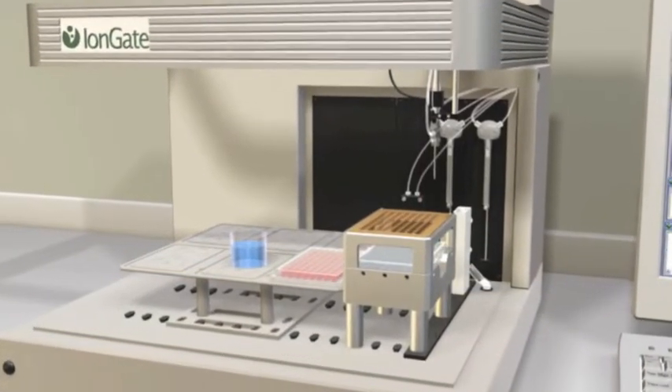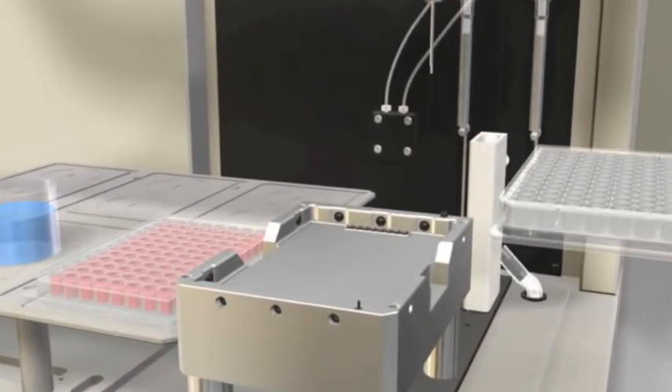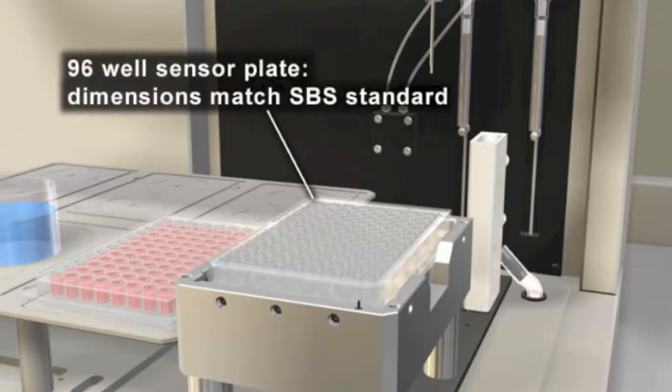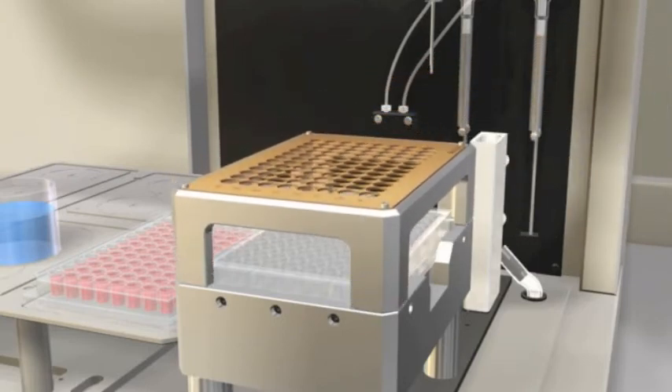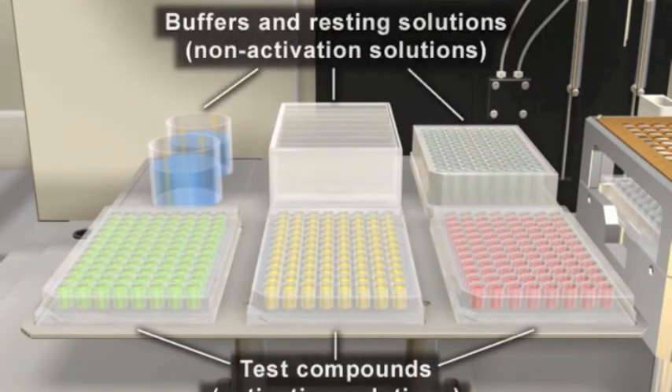The compact benchtop unit accommodates all functional components of the surfer workstation. The disposable 96-well sensor plates can be easily reloaded into the sensor holder. The top assembly completes the detection unit and provides electromagnetic shielding. The flexible workspace accommodates a variety of containers and plates for the storage of specific assay reagents as well as activating and non-activating solutions.